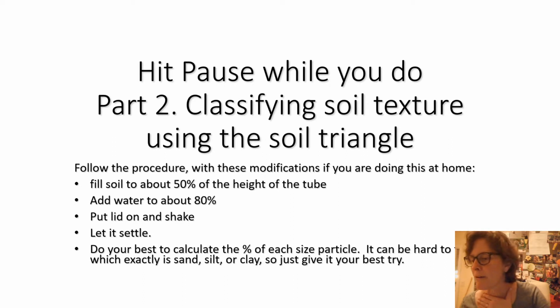Okay, next part, part two. This part can be hard. You have to estimate the percentage of each size particle in your soil. So go ahead again and hit pause while you do part two. Follow these instructions and the ones in your blue handout and join us again when you have gotten through step D.